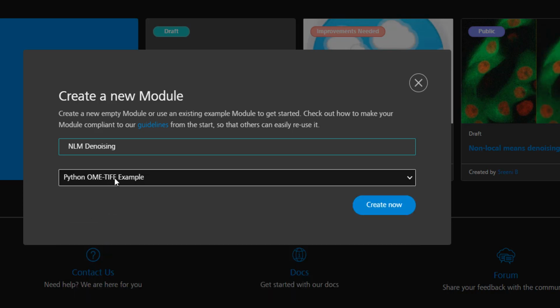And by the way, OME-TIFF stands for Open Microscopy Environment TIFF file. This is nothing but a TIFF file with an embedded XML that contains all the relevant metadata. So if you're working with proprietary images, for example Zeiss images, the file format is CZI, which contains all the metadata. When you convert that into OME-TIFF, the metadata gets saved into an XML that's embedded as part of this TIFF file. Then we tend to use this as a standard input and output image format for most of our modules, especially all the modules that deal with image processing on APEER.com.